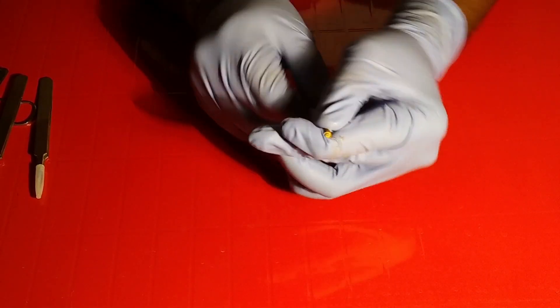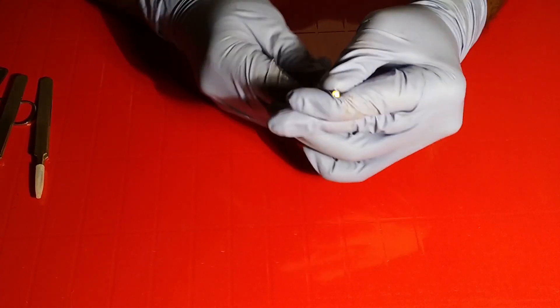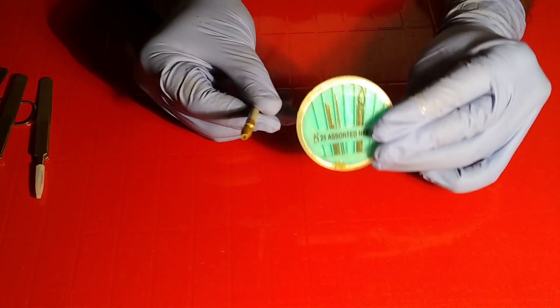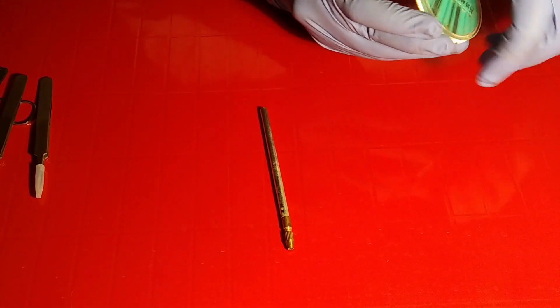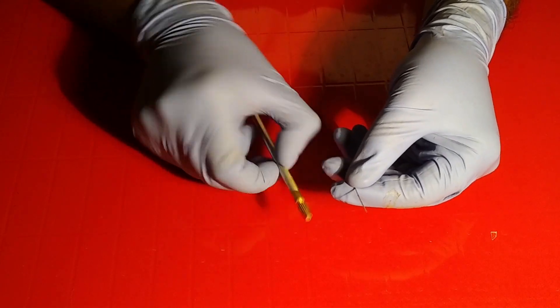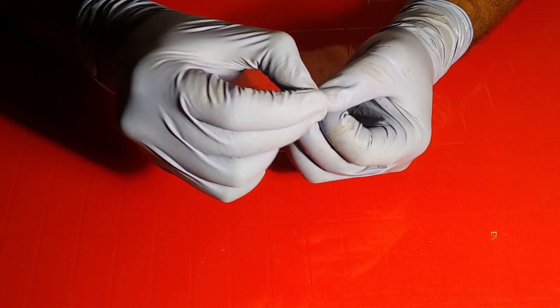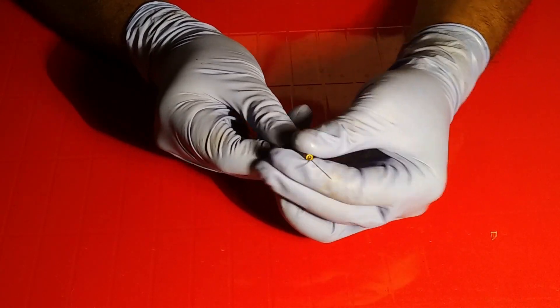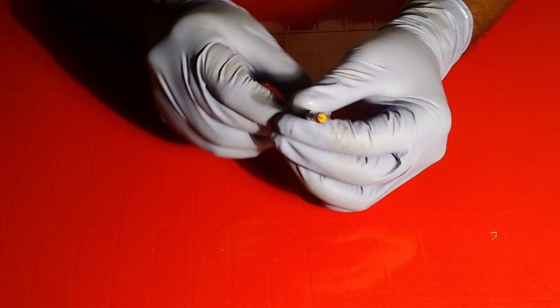A screw pattern is there at the tip area of the needle holder, so you can fit any needle of a required size. It can be replaced for different practicals. During display sections, students need to properly arrange different body parts, mouth parts, or ganglion on slides — they can utilize this needle holder. Now the needle is ready to use.